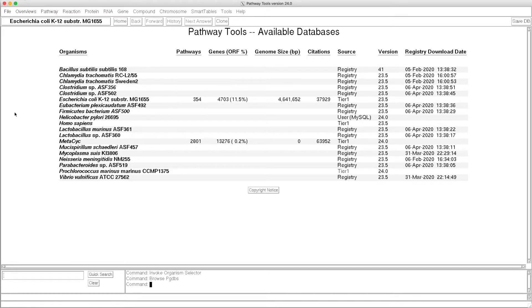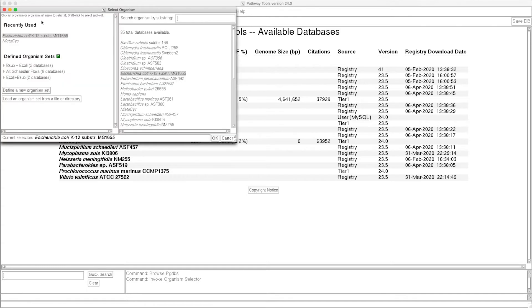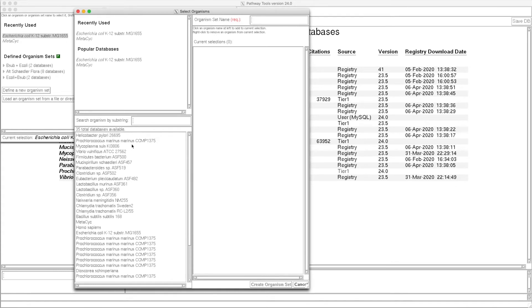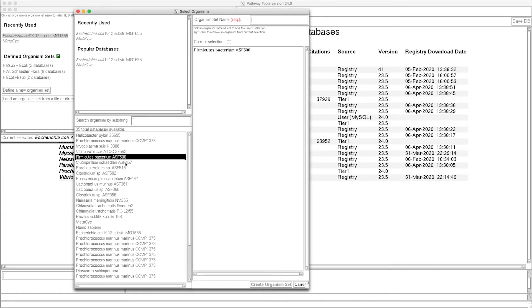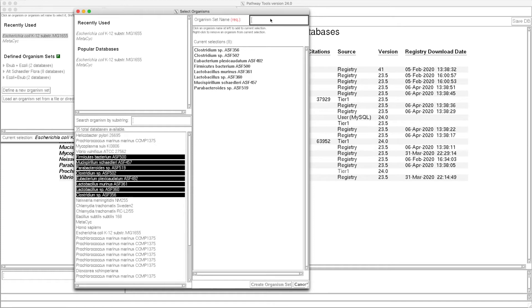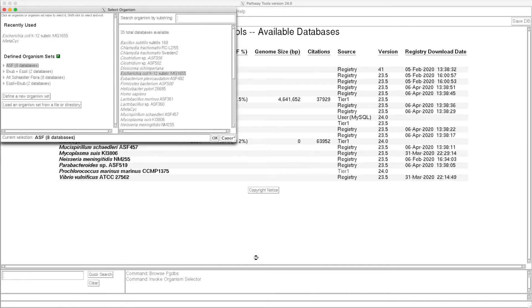Here I've got a number of PGDBs in my startup screen. Normally in Pathway Tools you have a single organism selected that all your queries are issued against, but there's a new mode in Pathway Tools where you can define a set of organisms as your query set. To do that, you click here, you say define a new organism set, and then we're going to select in the left pane all the organisms that we want to have in our organism set, in particular we're going to select the eight organisms in the altered Shadler flora. We'll give that organism set a new name, ASF, and we'll create the organism set, and we'll say OK, that's our current selection.